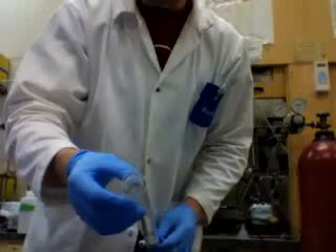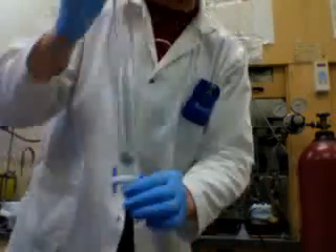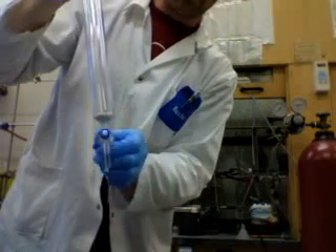This is a column, an empty glass tube with a diameter of about 2 inches on the inside. Here we've got a little valve at the bottom that opens and shuts.